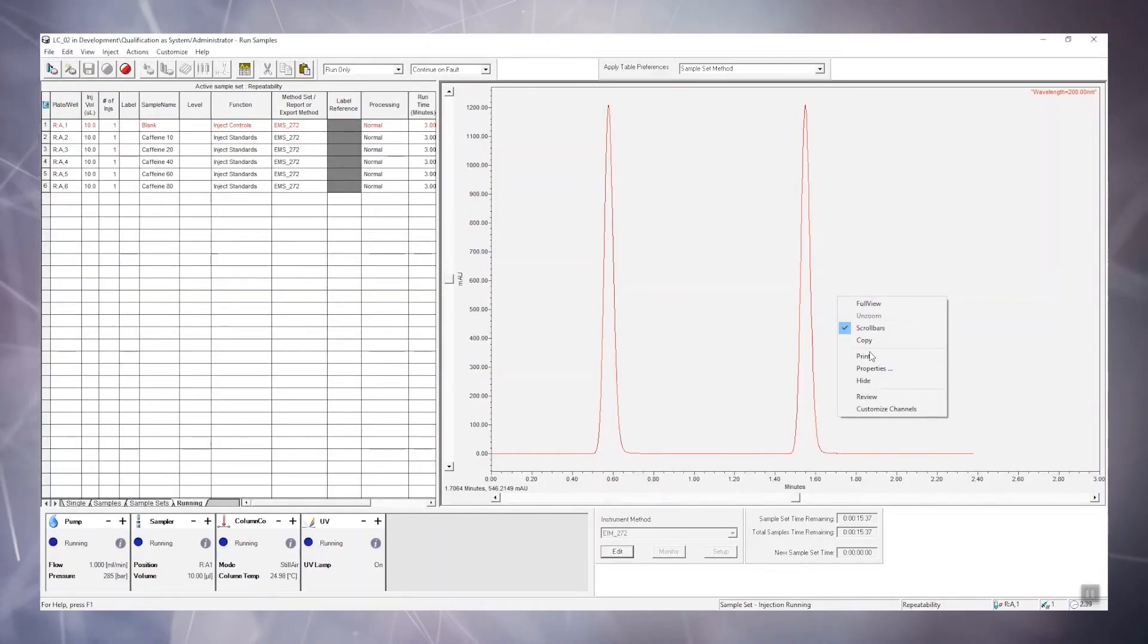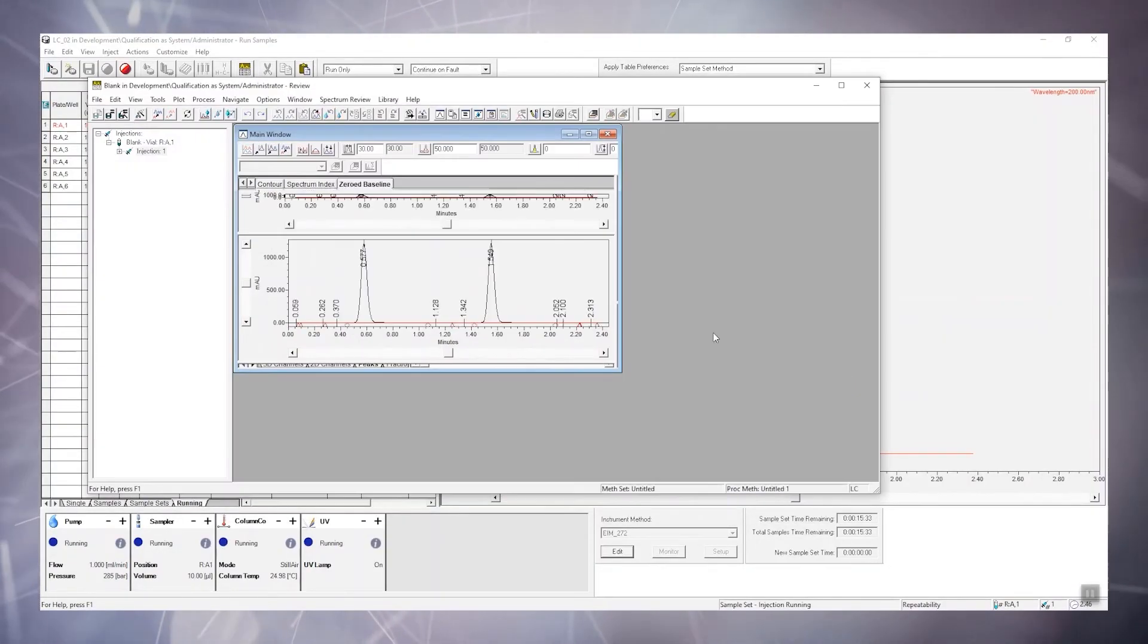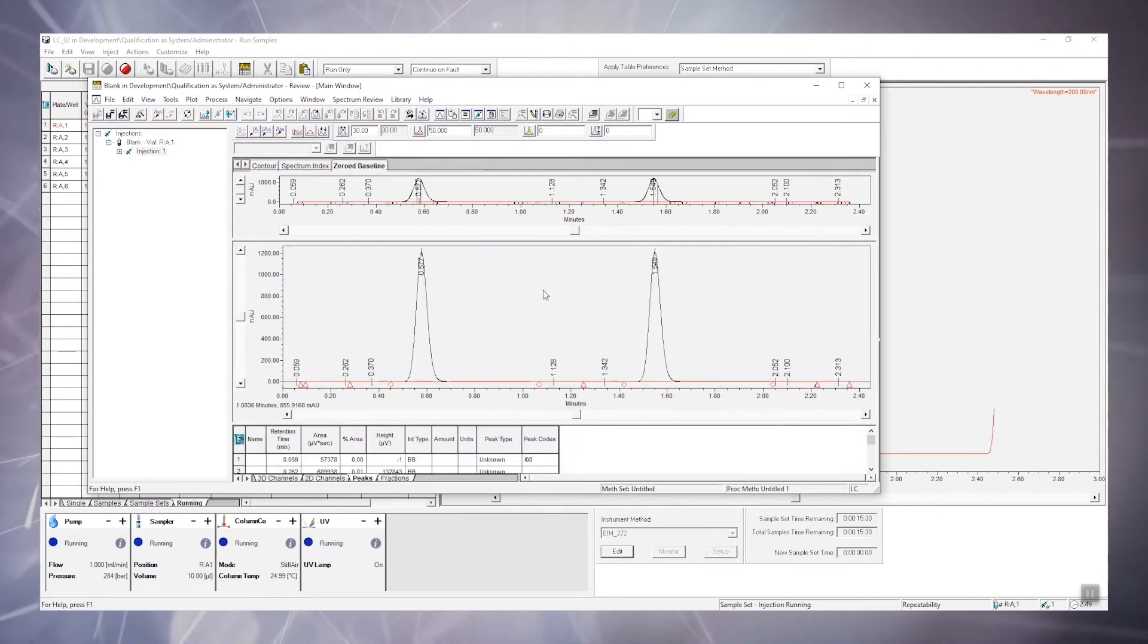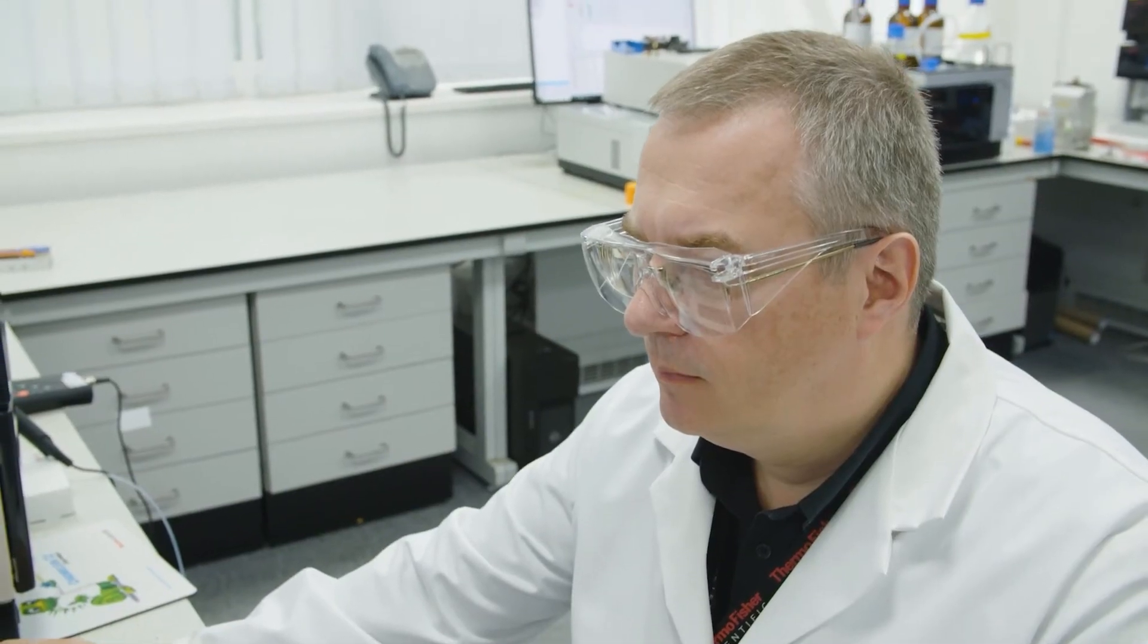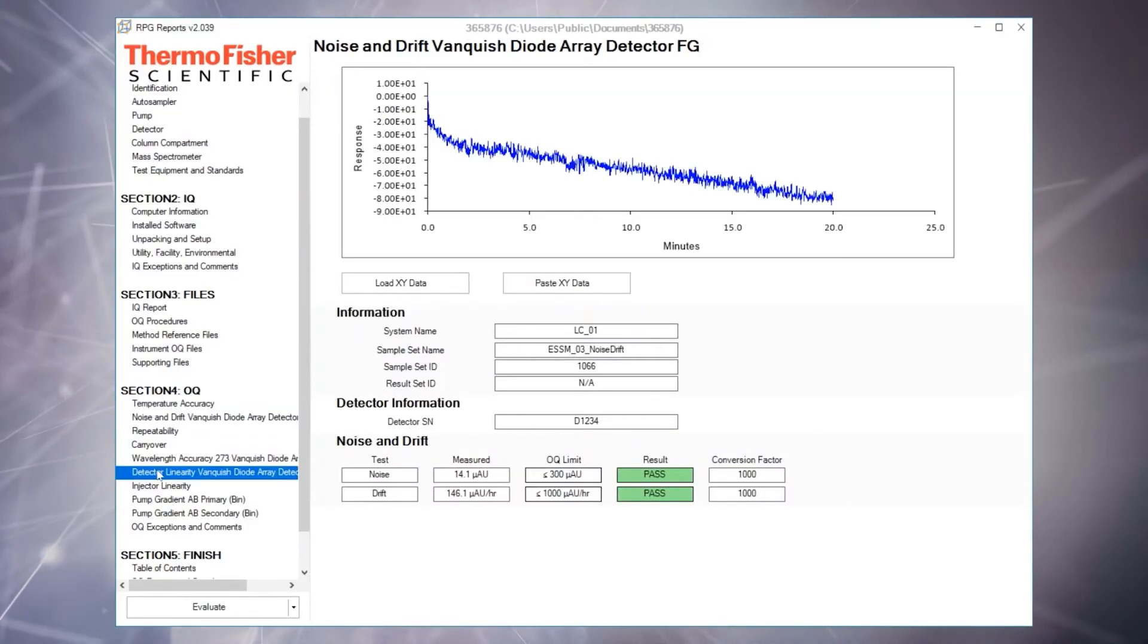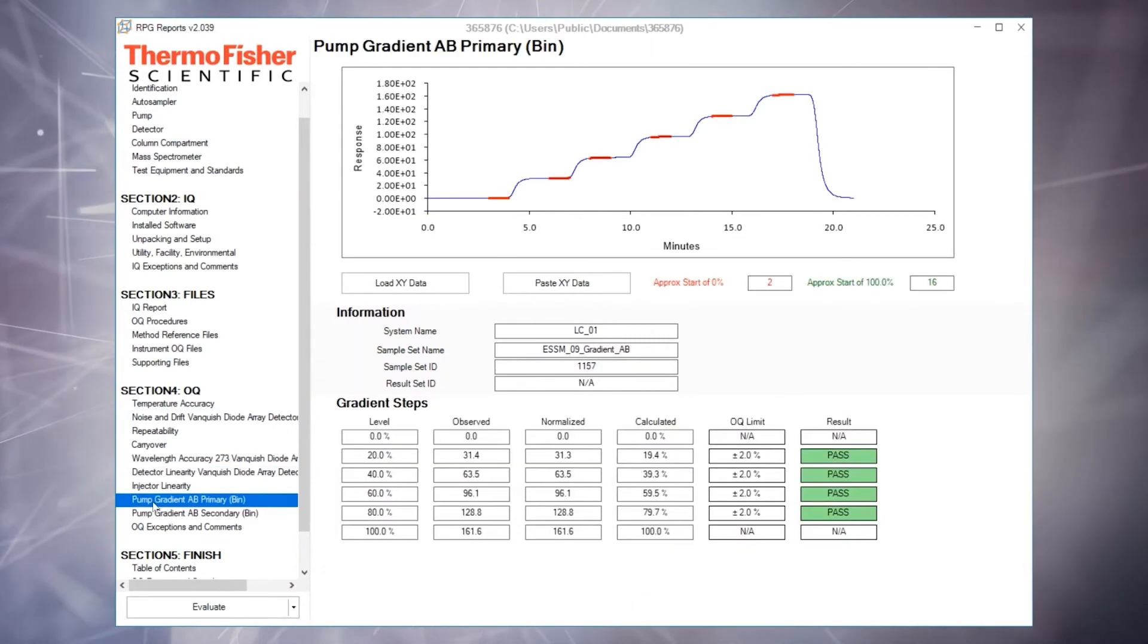As each test is completed, data is reviewed and integrated in the Empower instance. Results are reviewed through the proprietary application by the field service engineer and evaluated against defined specifications.